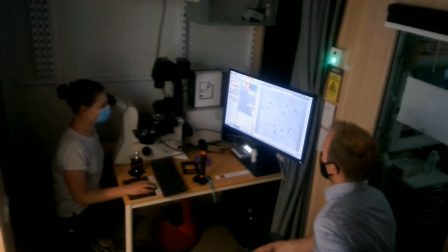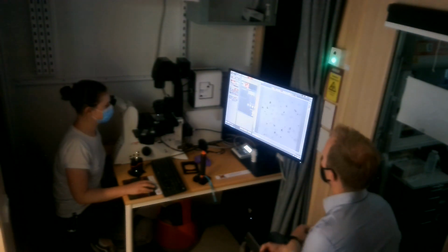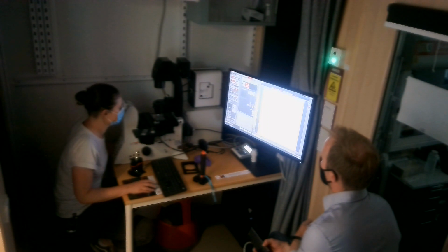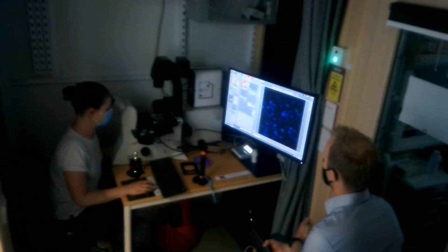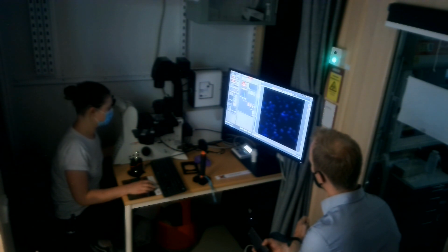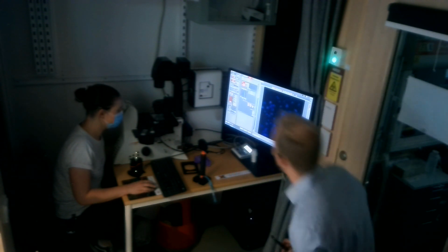So perhaps in this field you can set up a little set stack of this, if you want. See what that looks like. And I would probably set it up with the fluorescence channel in mind. So I would just move the focus so that you feel like, okay, now I am on the outside, and then set that and move to the other side. That will give you 18 steps, so that's perfectly fine.